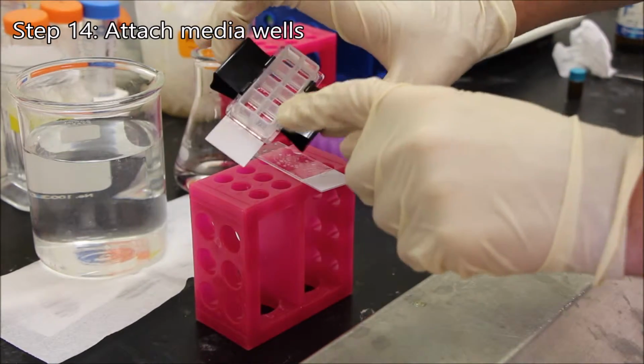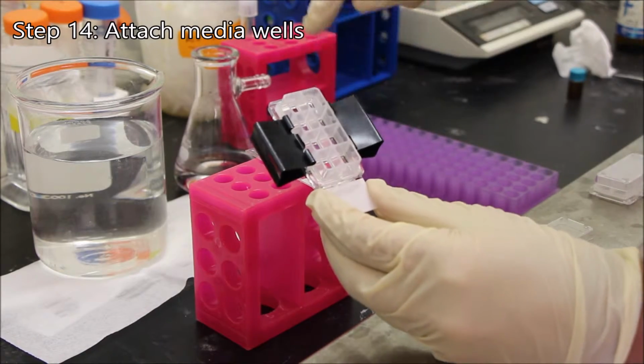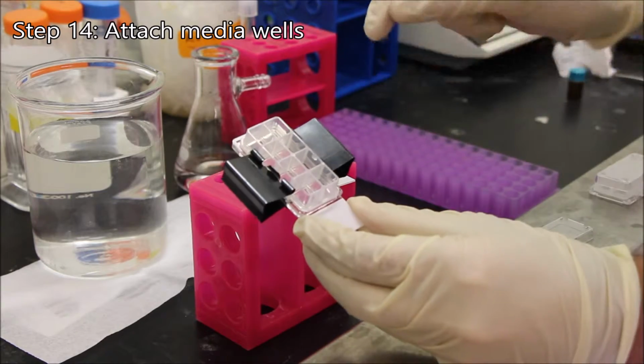So now I have a gel that's partitioned into 8 distinct wells. And so it's 8 distinct gels now. There's no fluid flow between.